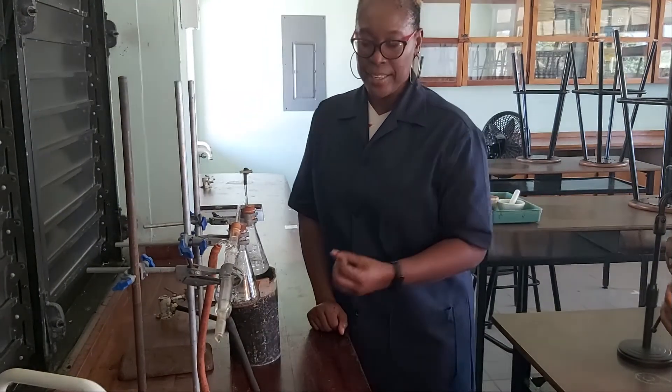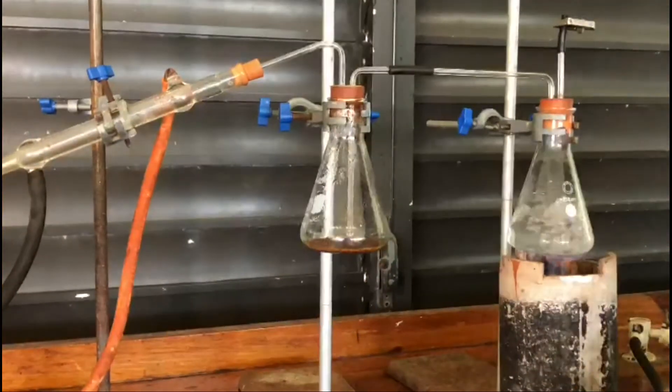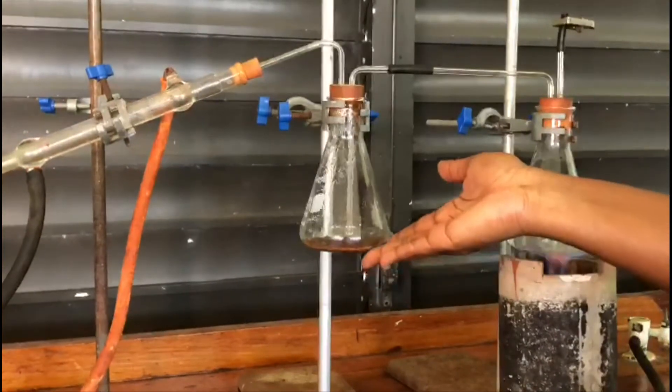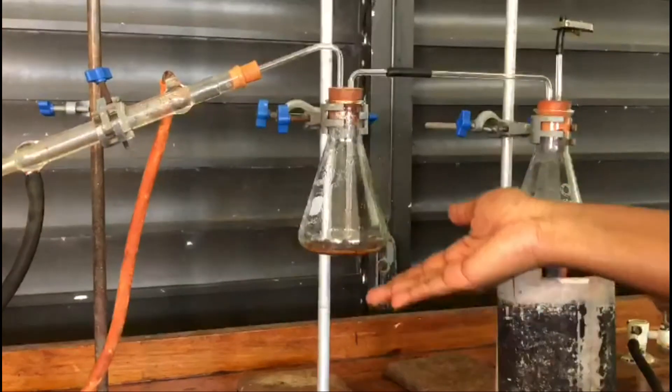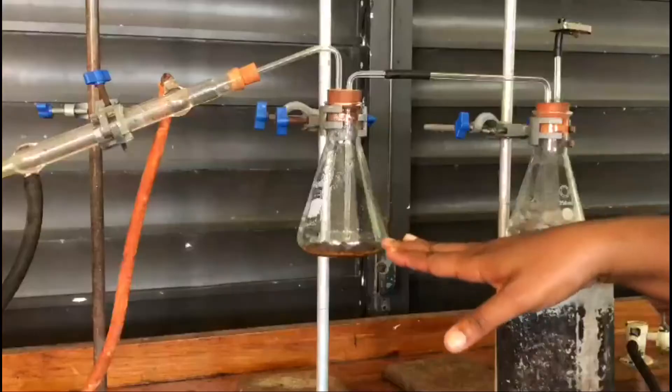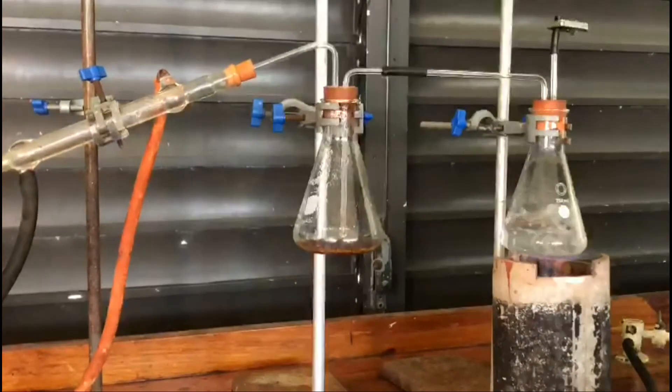The second thing is that as these vapors cool and condense, they actually heat this flask. The flask is quite hot to the touch even though we are not directly heating it or its contents—the condensing steam is heating the flask.